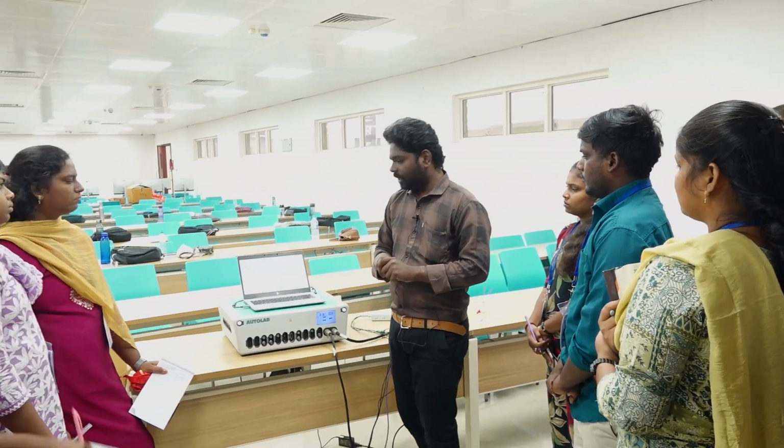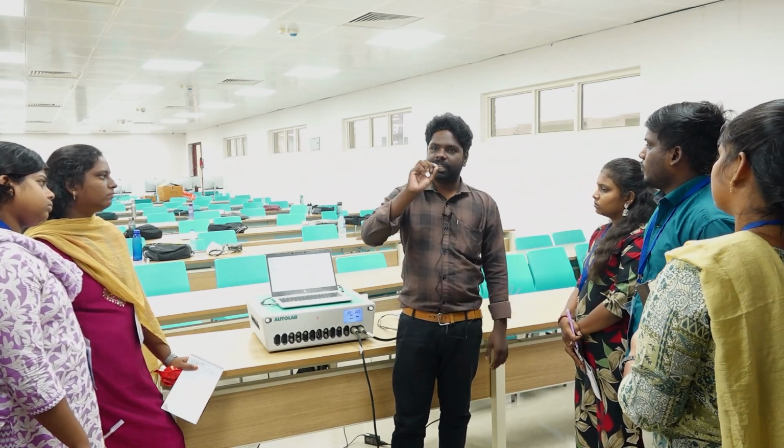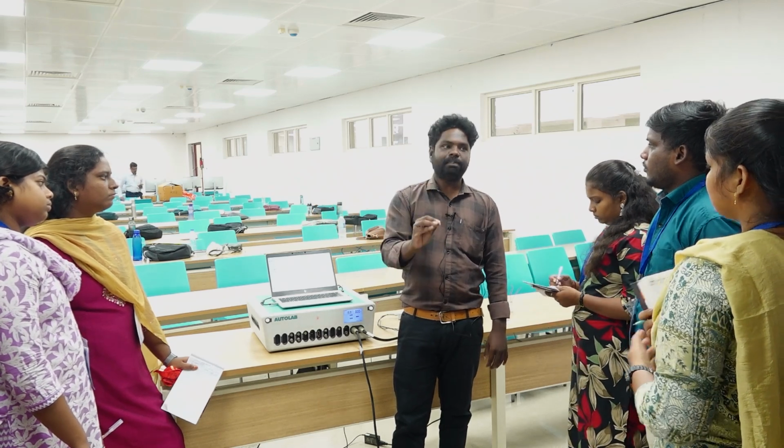In EIS, we need to apply some input to get the output, right? So what are we going to apply? Here we are applying a pure sine wave. Simply we are applying frequency, that is our input.